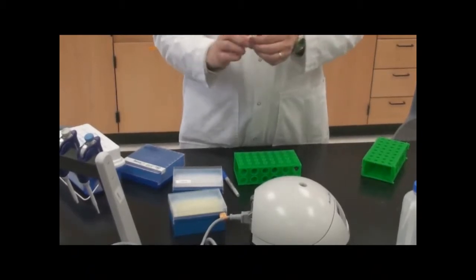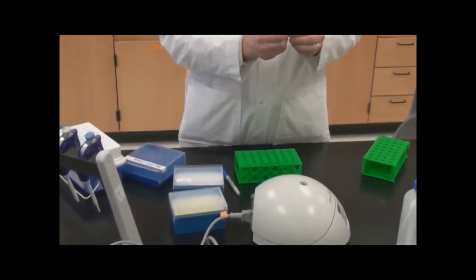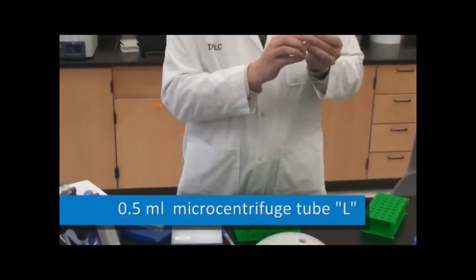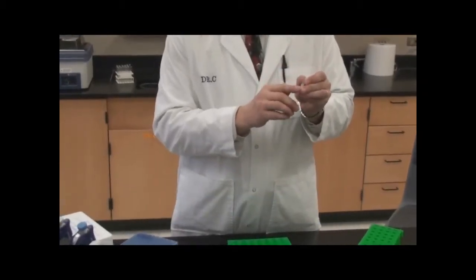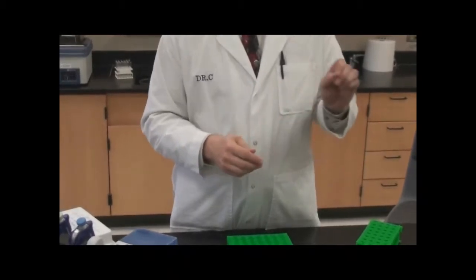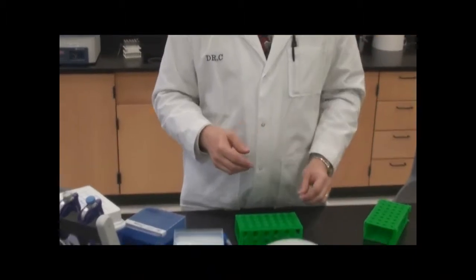It only takes about one microliter, and so when you come in you're going to find these smaller test tubes. It's going to have an L on top of it, and that stands for the ligation buffer. In the bottom you'll almost not even be able to see it, but there's going to be a one microliter drop, like less than a drop, of ligation buffer, and so you'll just take this tube and make your ligation reaction right in this tube.